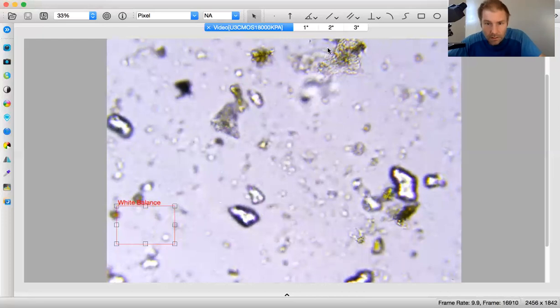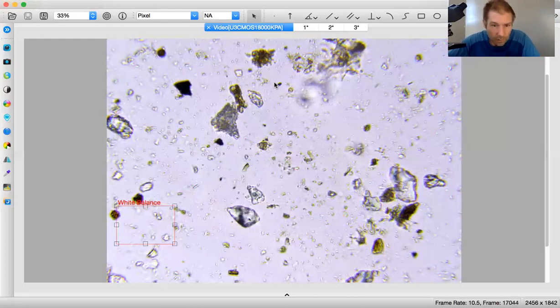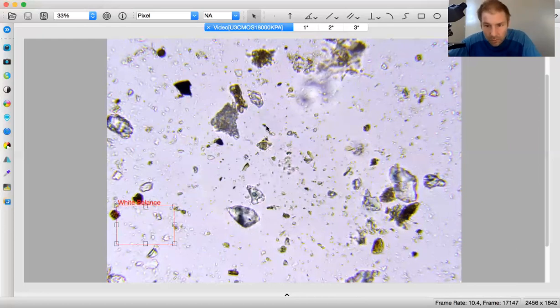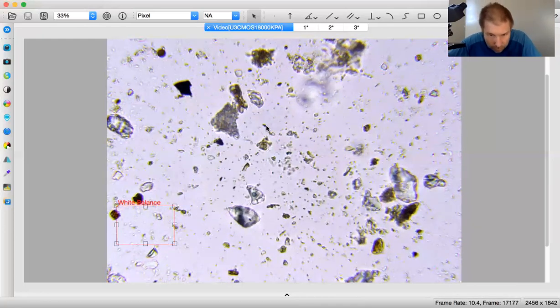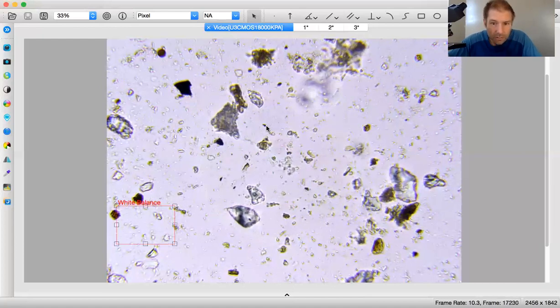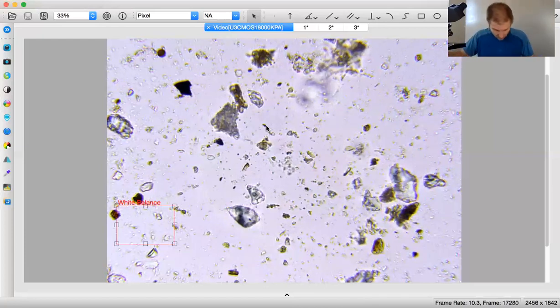I'm not sure that's actino. I'm gonna skip that one, but this one definitely looks like a 90-degree break at the end. So we're gonna count that. It's like a 0.02. Let me see if there's anything else here. That might possibly be one, but I don't like that bump in the end. Yeah, looks like we're getting 0.02 on this one. 0.02 actino.